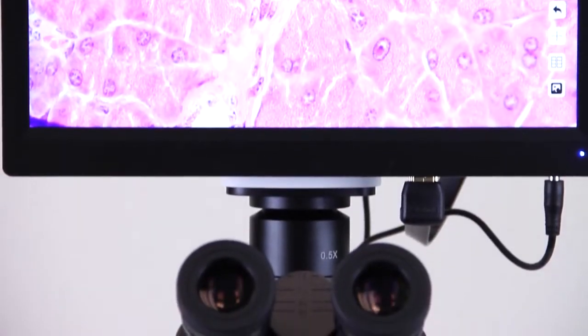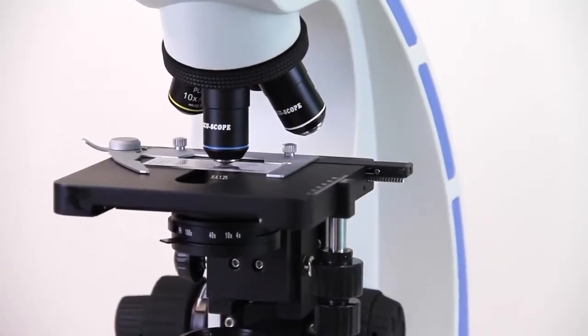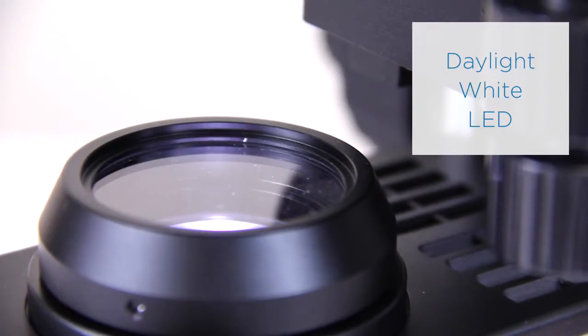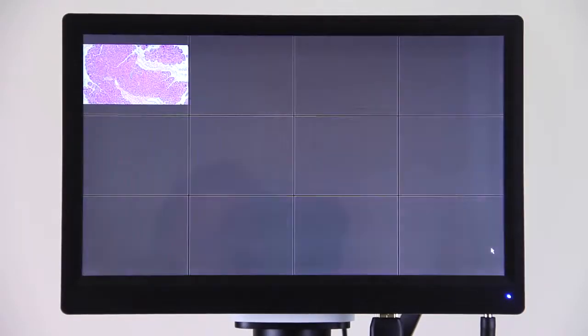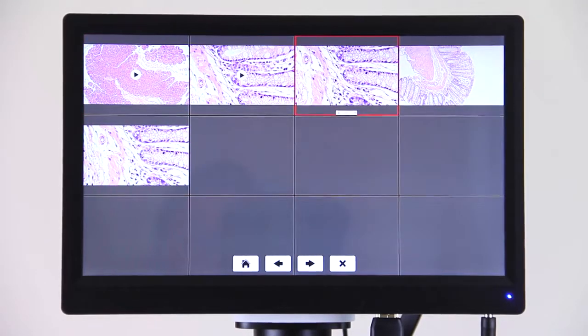It's a digital imaging solution designed to enhance the veterinarian's laboratory experience with their staff and pet owners. This system combines a daylight white LED and enhanced color correction to produce stunning high-resolution images and video that can be captured and archived.